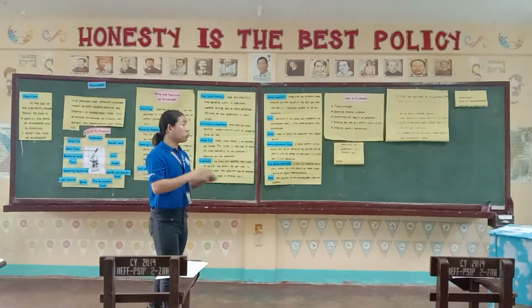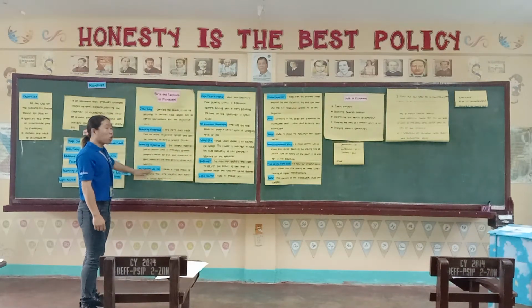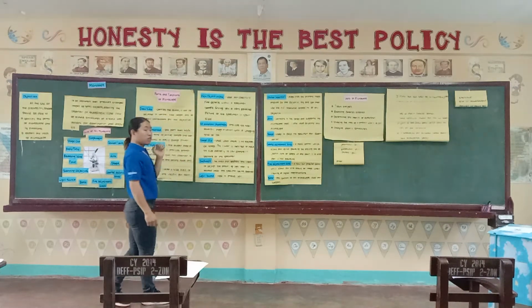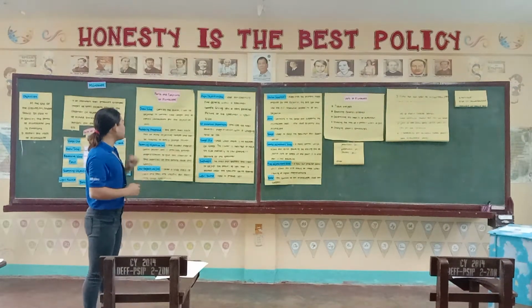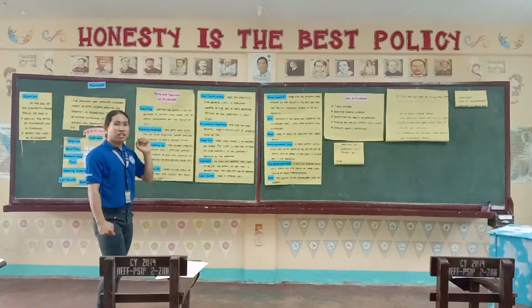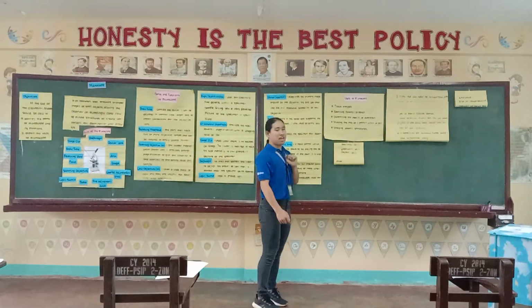So be able for us to magnify or to study tissue analysis, we have to use the microscope because it has the scanning objective, the low objective, the high objective, and oil immersion objective, in which we can observe the fine details using the high objective or the immersion objective. So in tissue analysis, we have to use what? Microscope. Second, examining forensic evidence.